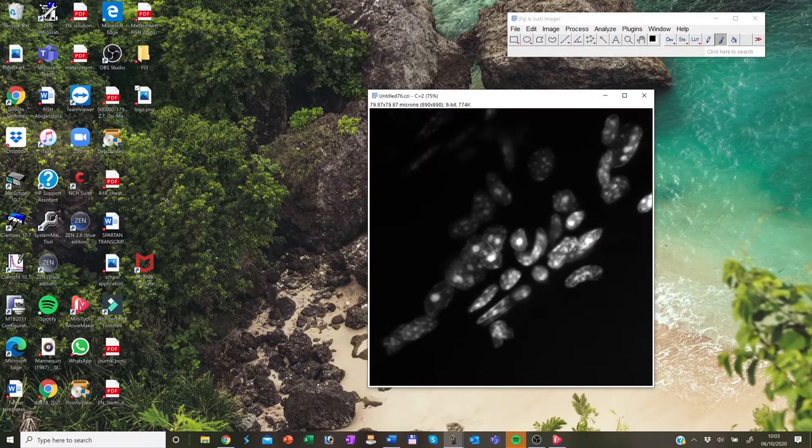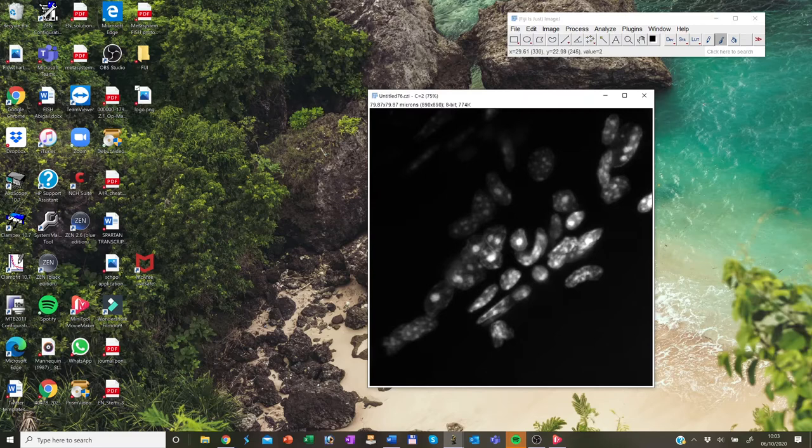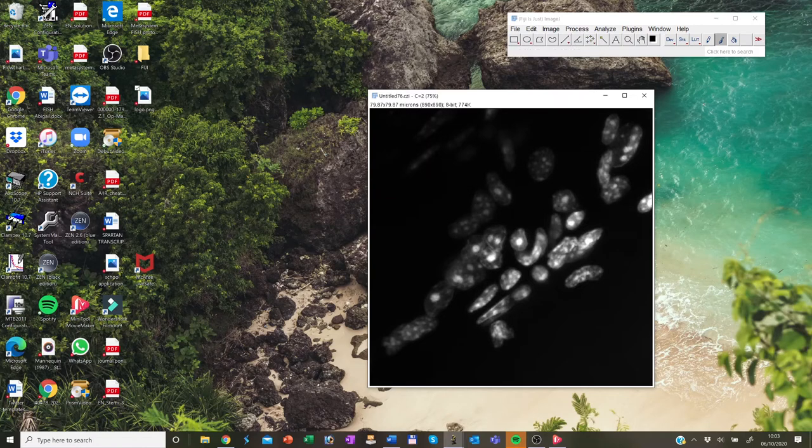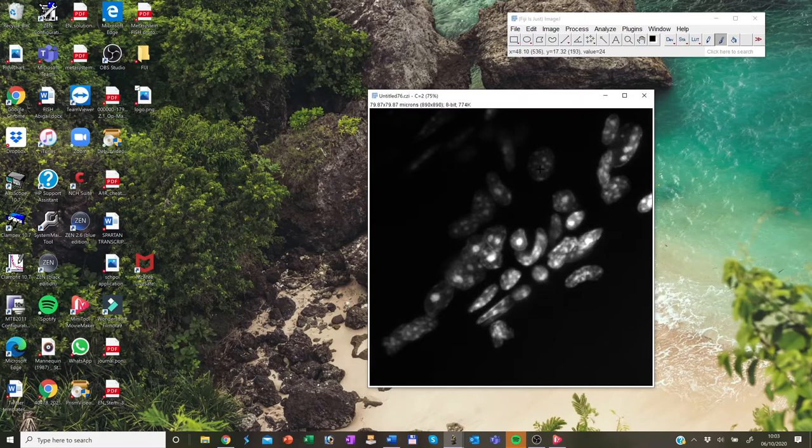So this window has a file name as a title and it displays some useful information above the image. When you move your mouse over the image, you get the coordinates where your mouse is relative to the image and you also get a value which changes when you move the mouse.